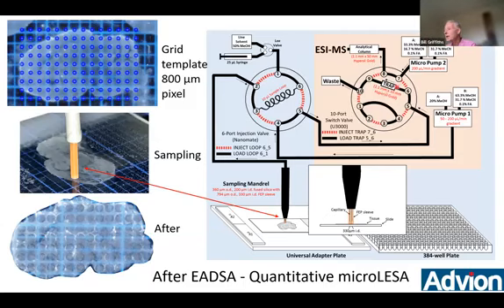We then elute the sterols from the trap column onto an analytical column, and here we're able to separate out the different sterols, so we're able to separate out these isomers. The advantage of using the LESA is we can connect it to an LC and separate out isomers. The disadvantage, of course, is a really major loss in resolution.